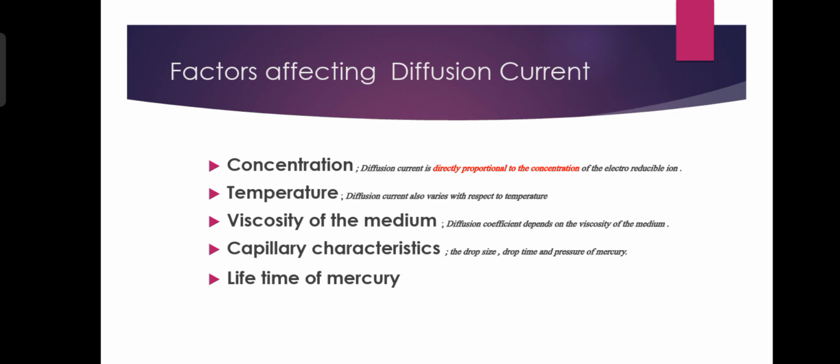As the viscosity of the medium increases, the diffusion current decreases. It is inversely proportional.